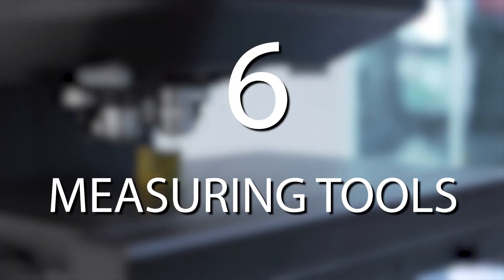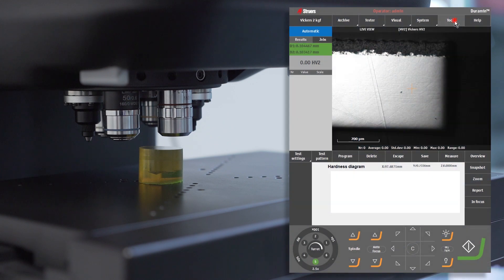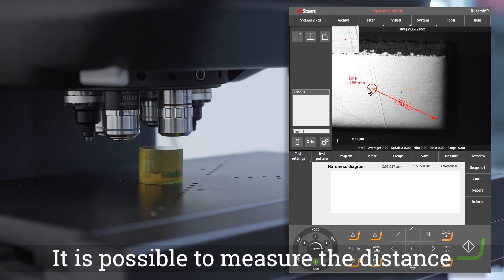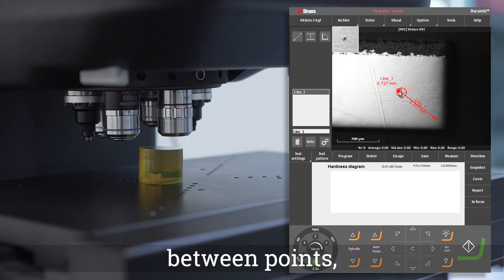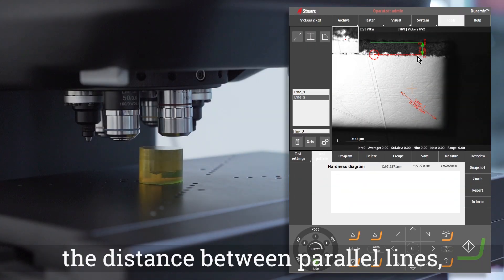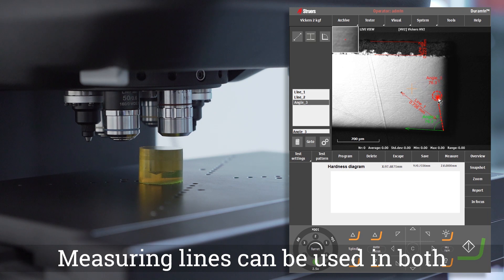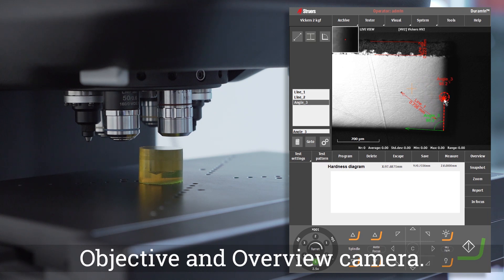Measuring Tools. We can use the measuring tools as construction lines. It is possible to measure the distance between points, the distance between parallel lines and angles. Measuring lines can be used in both objective and overview camera.